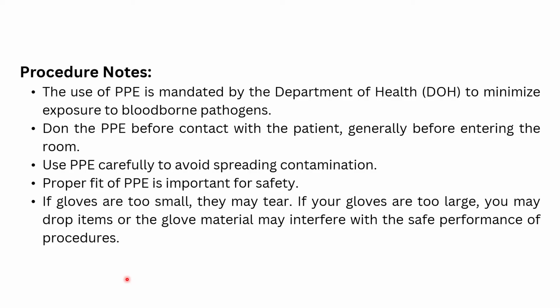You have to properly fit your PPE. That's very important for our safety. And if ever the gloves provided for you are too small or too large, make sure to change them and use gloves that are of your size.